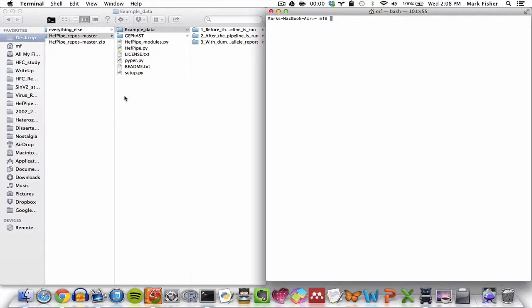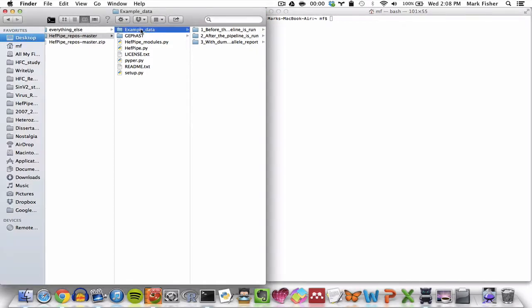Hey, and welcome back to Hefpipe. In this video, we'll finally get started running the pipeline on the example data. For the first step, we'll open the directory called ExampleData, right here, that's included with Hefpipe.